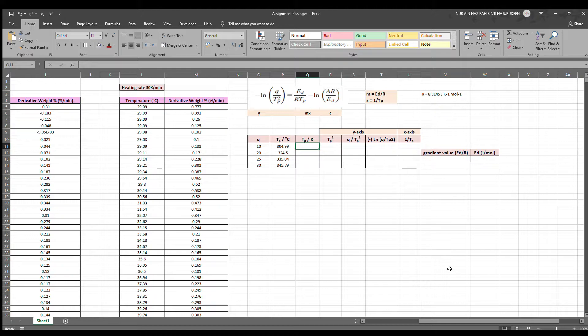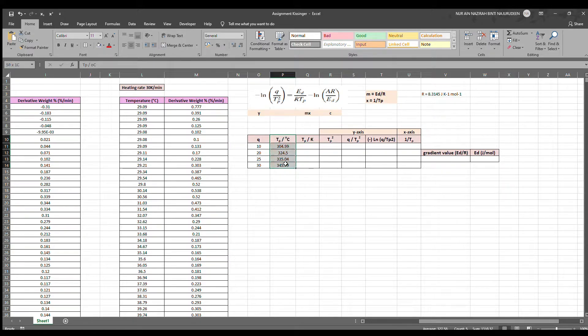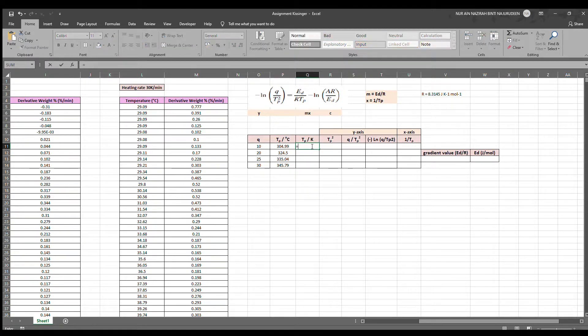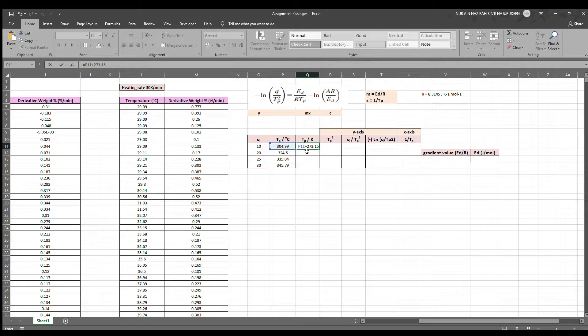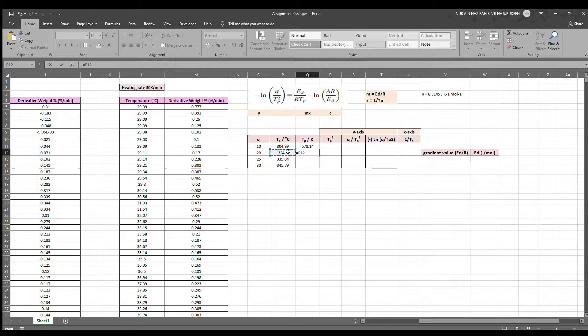Now that we have all our peak temperatures for all four sets, we shall convert the values into Kelvin by adding 273.15. What we have to do is equate it, press on that cell and add 273.15, and we repeat that for the other three data.